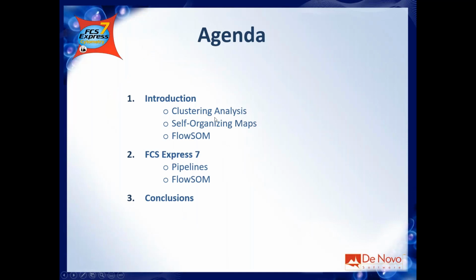Let's see the agenda for today. As usual, I want to provide you with an introduction on the topic. So we will see why we need clustering, what clustering is, and what self-organizing maps are, which is the core part of the FlowSOM algorithm.